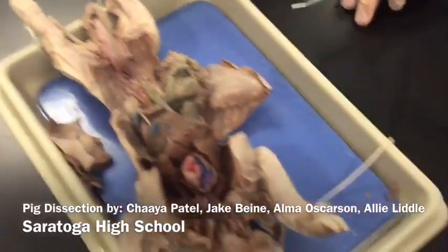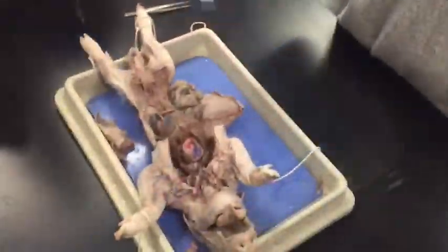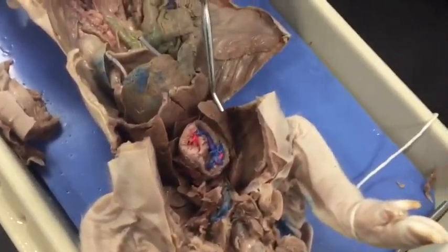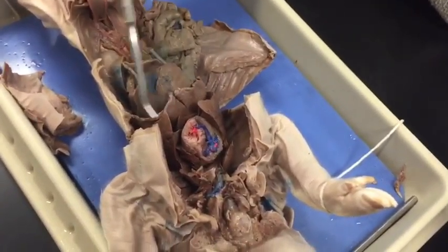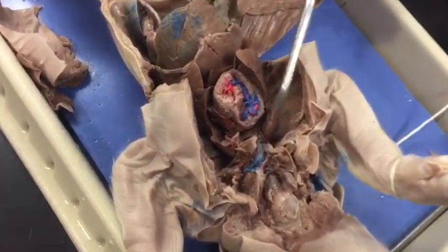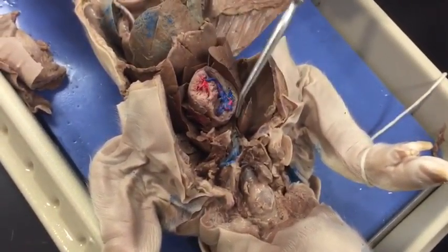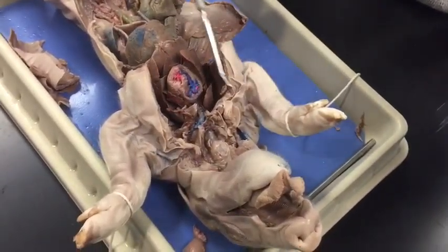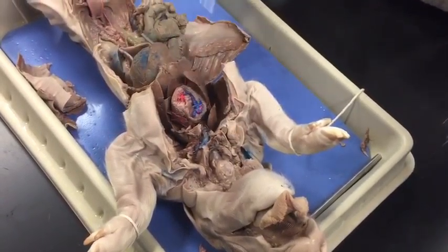Okay, now we're on to the respiratory system. So the lungs, which are right here around the heart, take in the oxygen, and the diaphragm, which is here, separates the top and the bottom of the body. The trachea connects the larynx, or voice box, to the bronchi of the lungs, and it provides the airflow to the lungs.